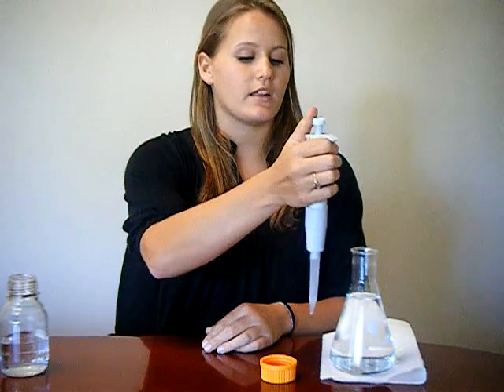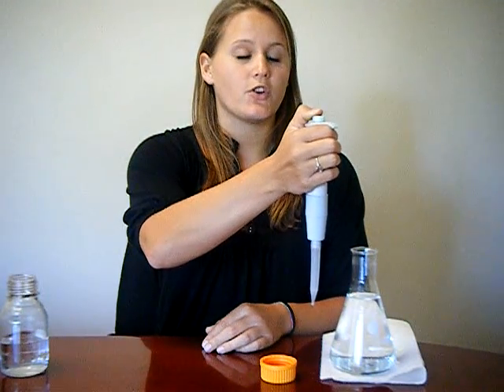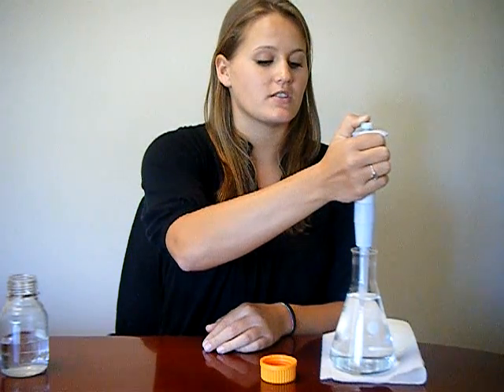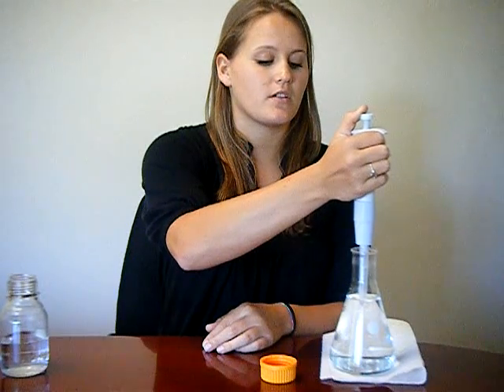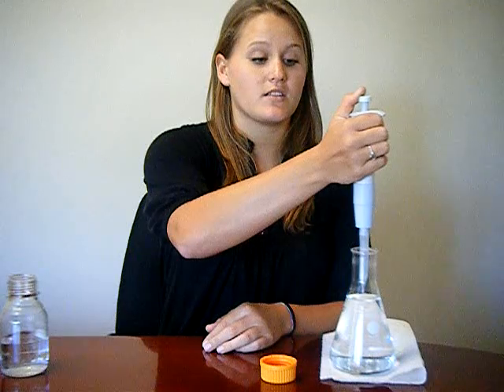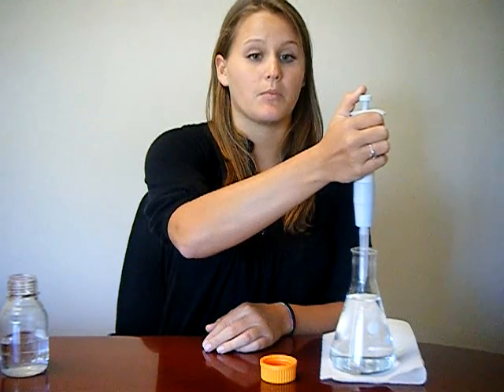When collecting a liquid, press down to the first stop outside of the solution. Submerge the tip into the solution and slowly release the plunger. If the plunger is not slowly released, the liquid will be sucked up into the machine and possibly ruin the parts.